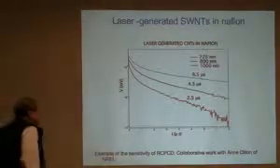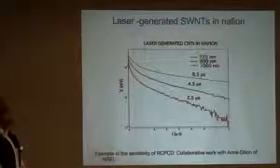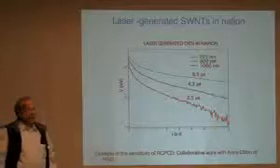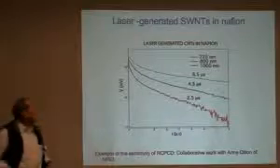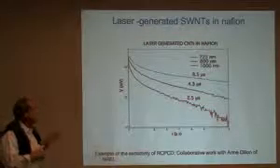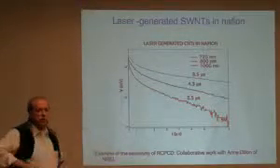Here's an example of the power of this technique. This was done in collaboration with Dr. Ann Dillon at NREL a couple of years ago to show the sensitivity of this technique. We had single-wall carbon nanotubes in Nafion binder, so the whole sample, the complex matrix, is coupled to the antenna system of the RCPCD system, and we see transient decay, and this shows different wavelengths.